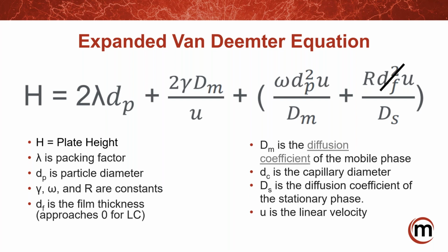So when you look at the A, B, and C term, this is really what the math is behind it. So just looking at the C term all the way to the right, when Van Deemter wrote this equation, he had to account for gases and liquids. So the C term is broken up into a gas diffusion, so that term immediately goes to 0. So then you sort of minimize the C term because small molecules pretty much diffuse really fast in and out of the pores. Now, as the analytes get bigger, that resistance to mass transfer term becomes much more of a concern.